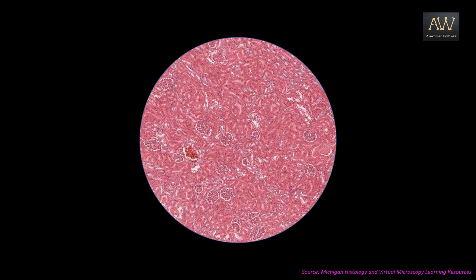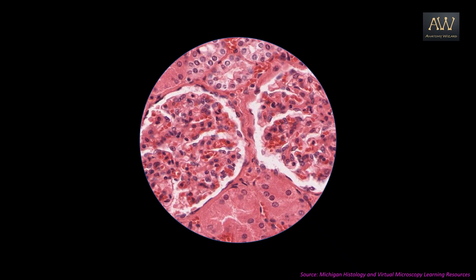When we look at this slide, it seems quite difficult to identify free space. But on careful observation, we can see minute areas of free space surrounding small patches of tissue. So let us zoom in on one of these areas. On zooming in, we can clearly identify the free space which was not very visible at low power. We can also see various types of cells on either side of these free spaces. What we need to look at are these flattened cells which are on the junction of the free space and tissue. These are typical of squamous epithelia.